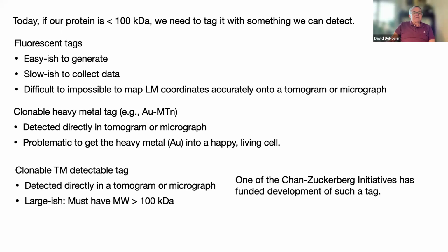So the final option is to have a clonable, detectable tag that you can detect using a target structure. And so these could be detected directly in the tomogram or micrograph. And of course, they have to be, in present days, over 100 kilodaltons. One of the Chan Zuckerberg initiatives has funded the development of such a tag. So we'll see how that does.